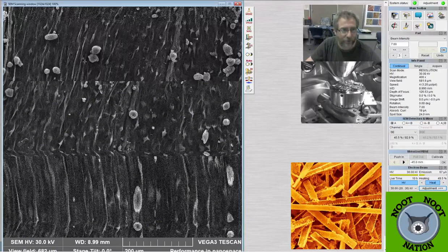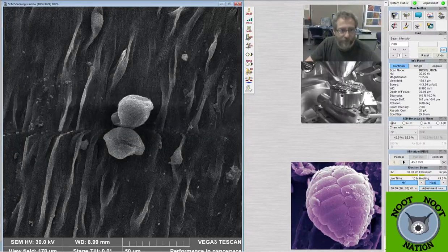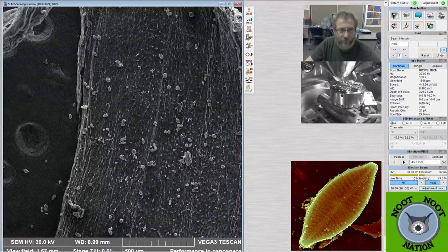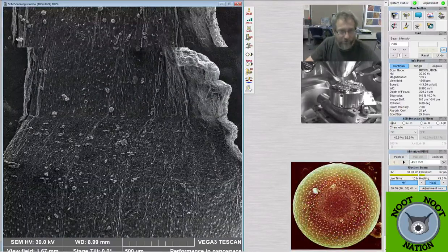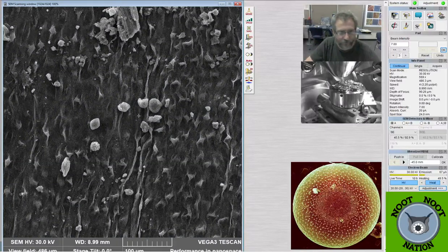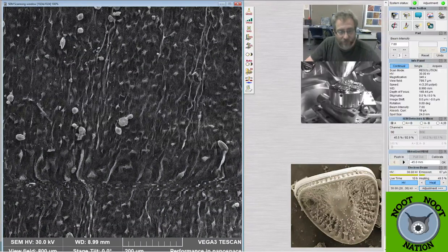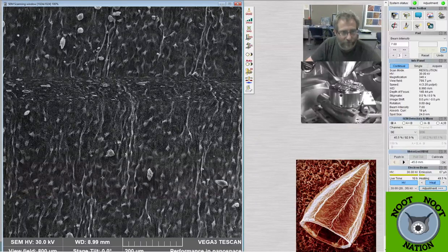So you can see there's a bunch of it up here. These are, I believe, maple tree pollen that we're looking at right there. And then these are, again, the cells of the petal. You can see a whole bunch of that pollen here. It's more or less all the same with respect to its shape. I had to open up the actual flowers to get to these, so I think it's pretty likely that it's just maple pollen, but there might be some other stuff that got mixed in. Wind and birds and insects can all transfer pollen. That doesn't look like it belongs here. It doesn't seem to match the same pollen as the rest of this, but maybe.